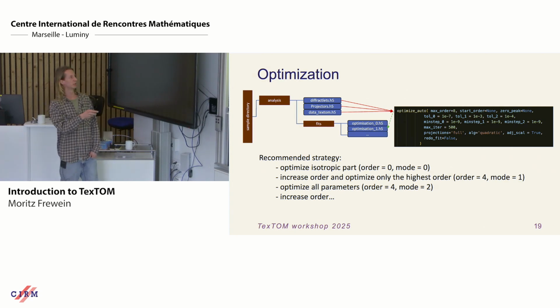So there's this pipeline optimize auto, which does exactly this, and you can just give it the maximum order you want.